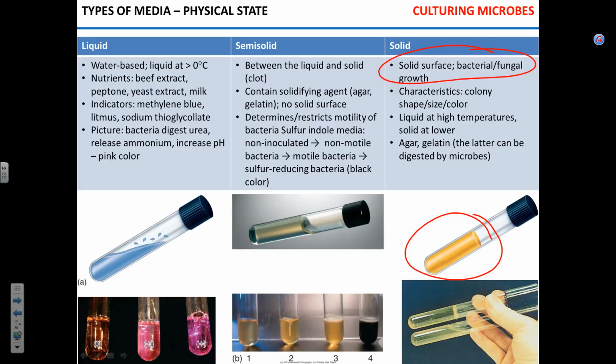Solid media that we use, agar, is liquefiable. It's kind of an awkward English word. I'm not sure about my own spelling, so trust me, you're not going to get any points taken away for not spelling it properly.